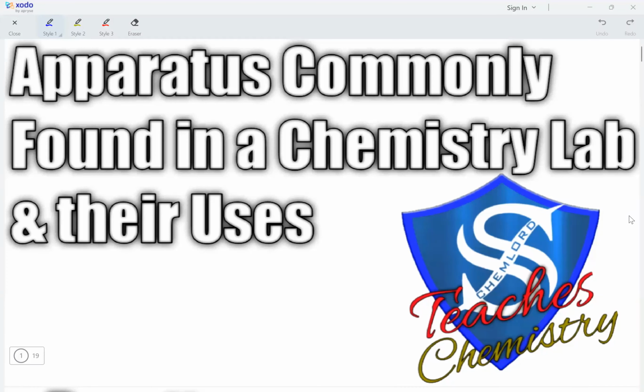Hi guys, this is experimental chemistry and we are looking at the apparatus commonly found in a chemistry lab and their uses.